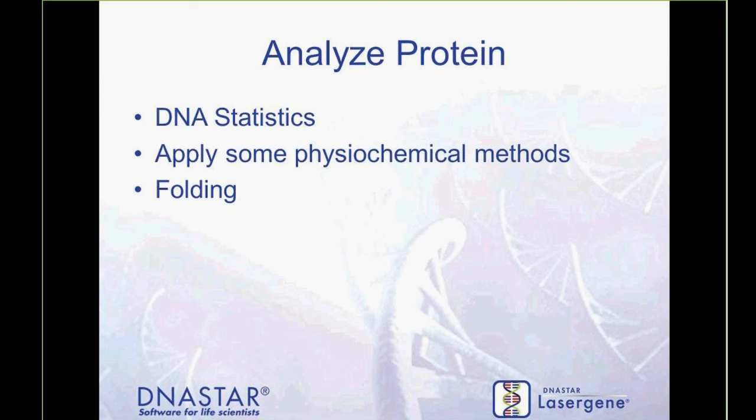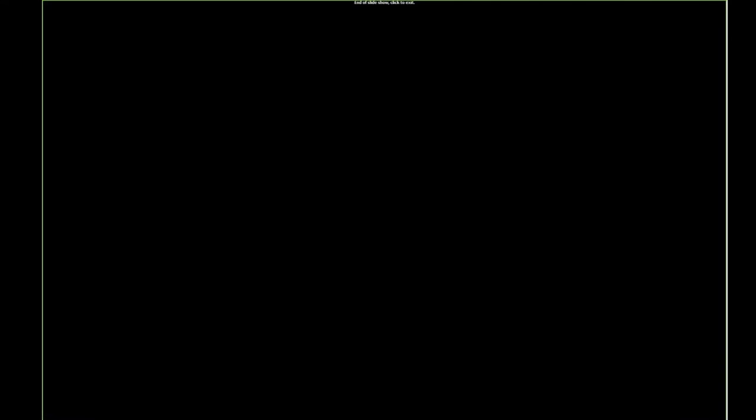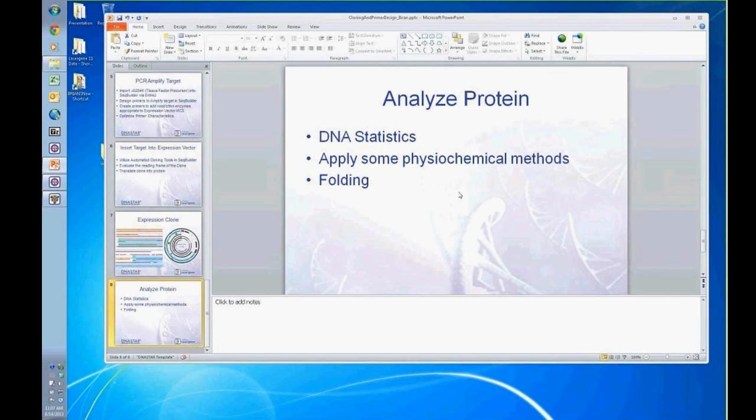And then the end result is I can show you how to take that protein, highlight any portions of that protein, and start folding it and generating a three-dimensional image for further downstream analysis. With that in mind, let's actually get into the software. So I'm going to minimize here.